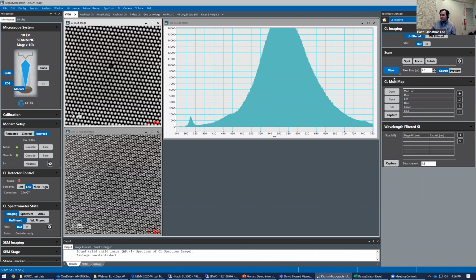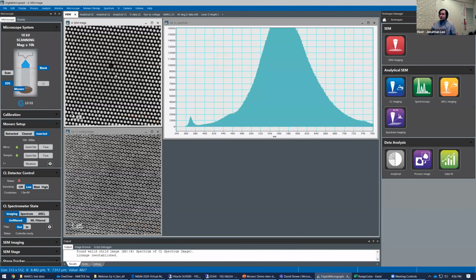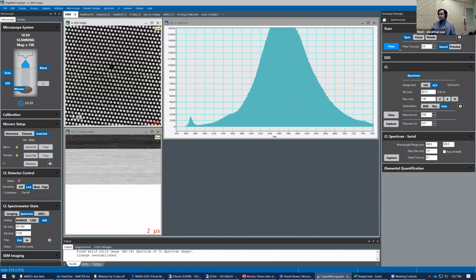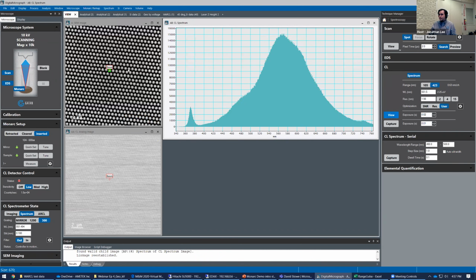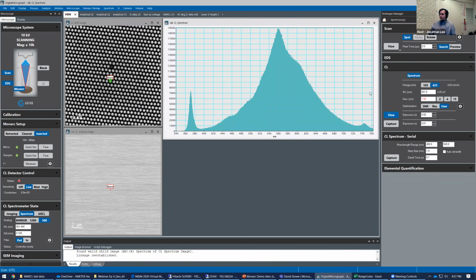But tuning of the slits is done by looking at the amount of spectral resolution that you effectively see. So if we go back to spectroscopy, with a 100 micron slit, we actually have a pretty decent spectral resolution. GMS is calculating 1.56 nanometer resolution. So it's well above anything I think that we would encounter here. We're not going to find anything of a 1 nanometer bandwidth.